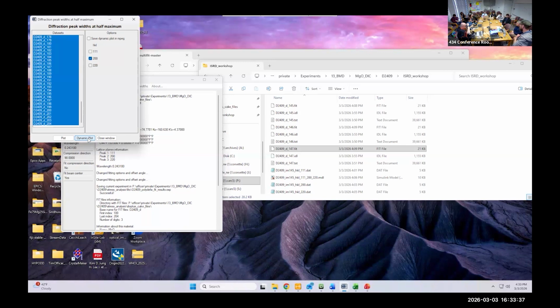Right now, it's not in great shape because it's kind of internet notes. That's what I was saying. If you send it to me, I can try to help you with some updates. Great. Certainly if you run an experiment here, we can help you with the analysis. This was a very straightforward, easy experiment to fit. They're not always anywhere near that easy. Sometimes it can be quite difficult to get everything just right.